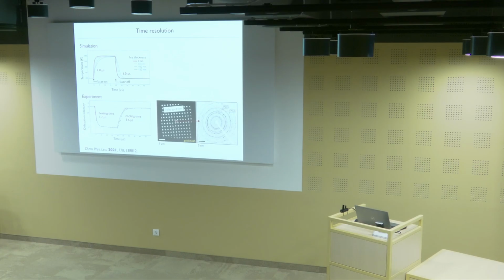Essentially, this is a pump-probe experiment, where this is a micrograph of the specimen support, and we collected a diffraction pattern here from the center of the grid square. This is where we aim the laser beam, and this is a diffraction pattern of polycrystalline gold, but we can use the diffraction intensities as a high-speed thermometer. If we record this diffraction pattern as a function of time with nanosecond electron pulses, and what I'm plotting here is the diffraction intensity as a function of time, you can see that once the sample starts heating up under laser irradiation, the diffraction intensity drops, then it stabilizes and it recovers, and we get very similar time constants here.